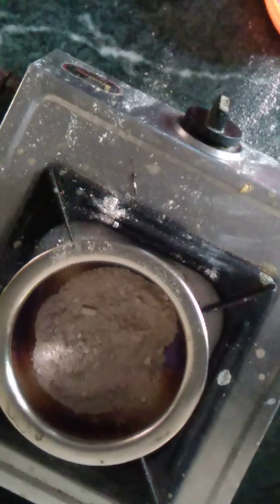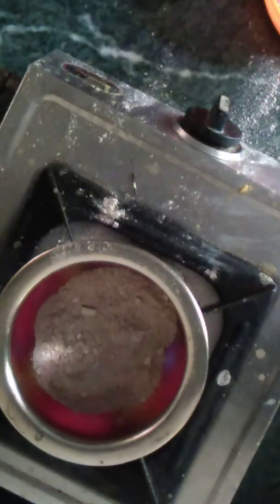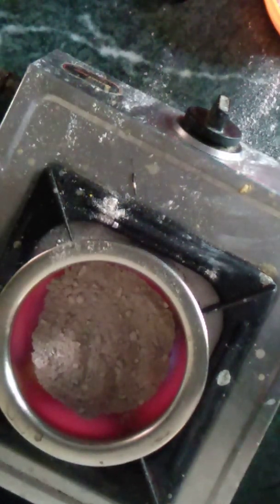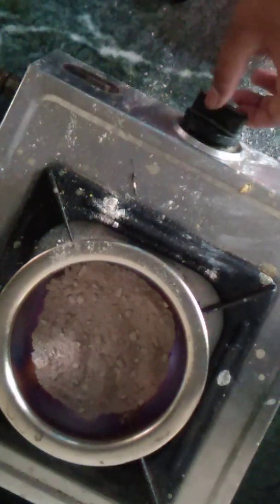The best thing to use for making such calcium oxide is a graphite crucible, because its melting point is 3000 degrees Celsius. So it can withstand this temperature of 825, but this container can also withstand that temperature. It is becoming red hot, the container. But our calcium oxide isn't doing that well. The sides are getting red hot, and at such times there is a danger of breaking the container. Let it cool.